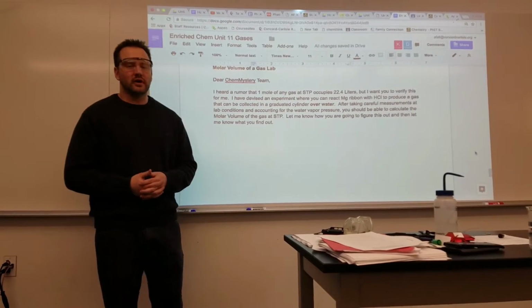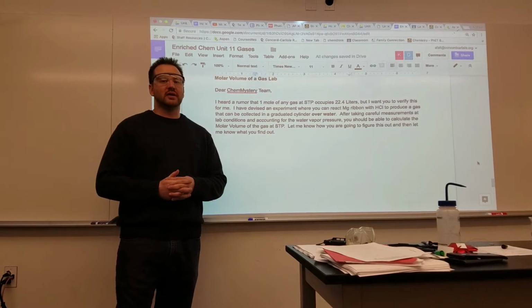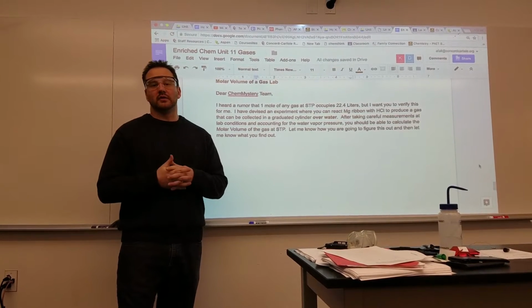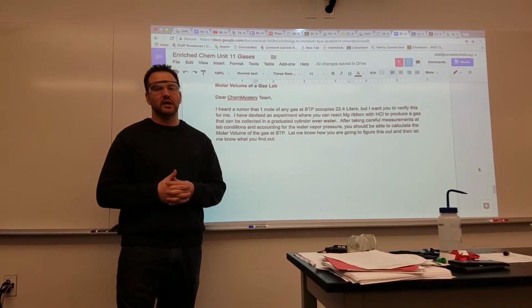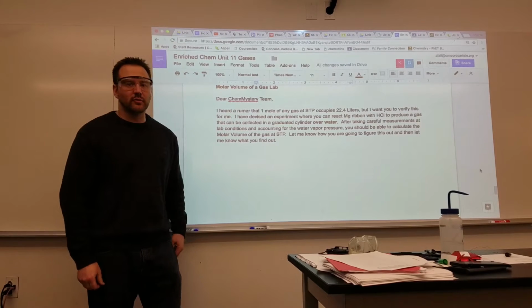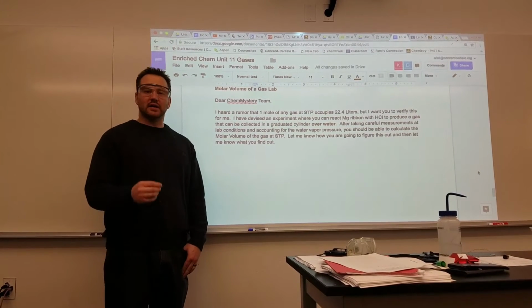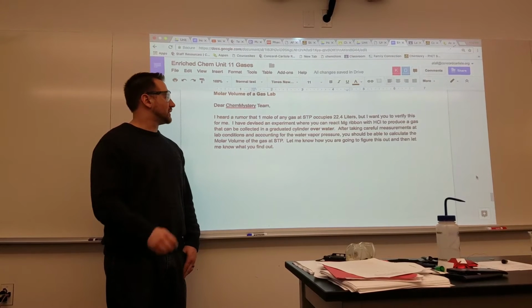In this video, we're going to talk about the molar volume of a gas lab that you're about to do. In the molar volume of a gas lab, you're trying to prove that a mole of any gas occupies 22.4 liters. And in order to do that, you're going to be making hydrogen gas by reacting magnesium ribbon with hydrochloric acid, and then collecting the hydrogen gas that forms in an inverted graduated cylinder.